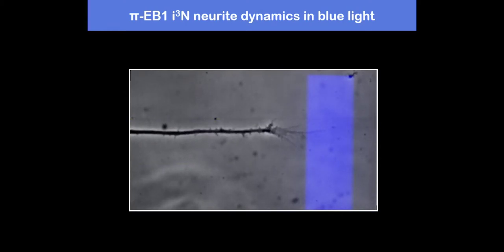I will let you make your own conclusions here, but would also like to caution that this is currently one of few experiments, and we are currently working to combine such optogenetic assays with chemotactic gradients to test how growth cone guidance is controlled by microtubule plus-end protein interactions.